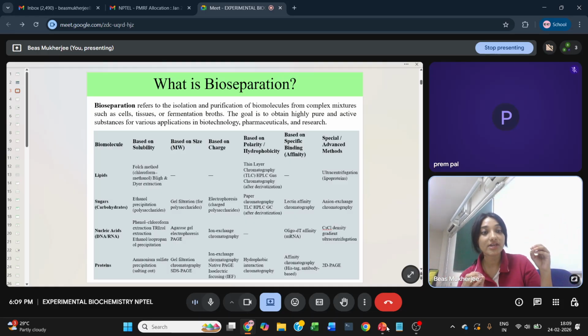Then we can have complementary probes having poly T, called oligo dT, a stretch of deoxythymidines. These will have affinity for this poly A tail, and that is why the mRNA will be stuck to the chromatographic column. So that is poly A tail targeting oligo dT chromatography, which is a kind of affinity chromatography.